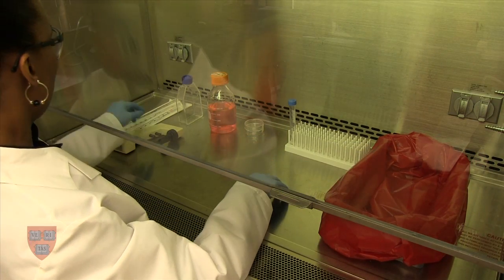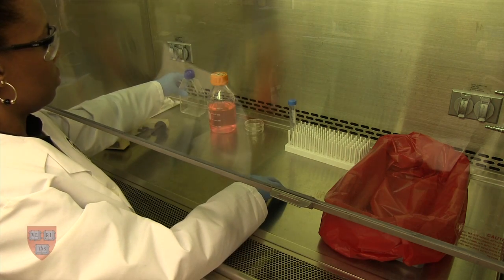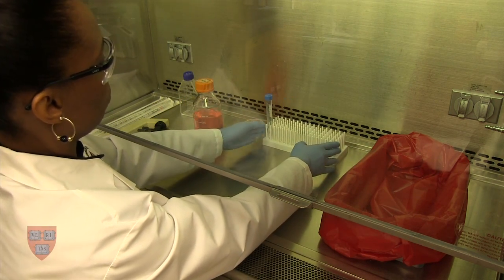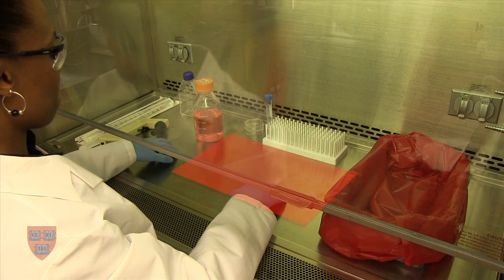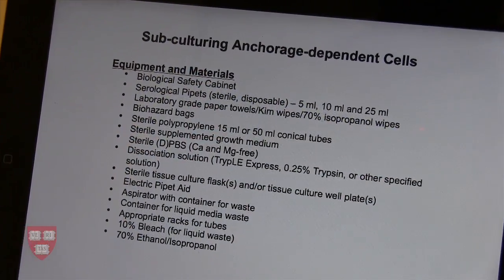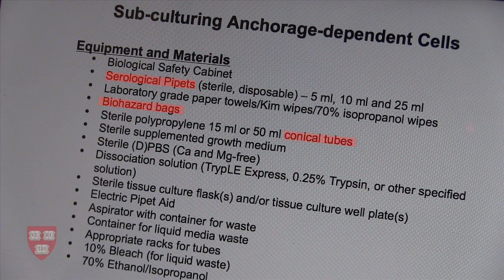Place all items that will be used in your procedure inside the BSC as far back as possible before beginning work. Work at a minimum of 4 inches inside the BSC. The middle section of the cabinet is the optimum work area. It is also useful to reference a list of all the items that you will need to conduct your work.